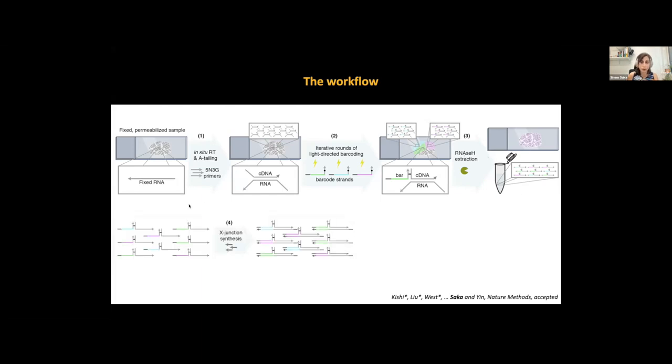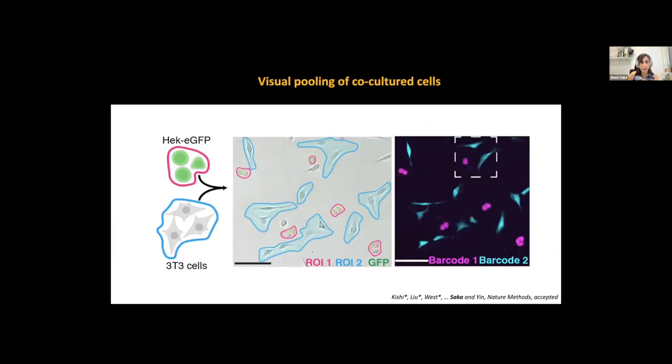And then we move on to doing the cross-junction synthesis, because we have all of these junctions that we now convert to readout strands. Then we perform more classical PCR amplification and the next generation sequencing library prep to prepare samples for RNA sequencing afterwards. So that's the whole workflow and how different parts come together.